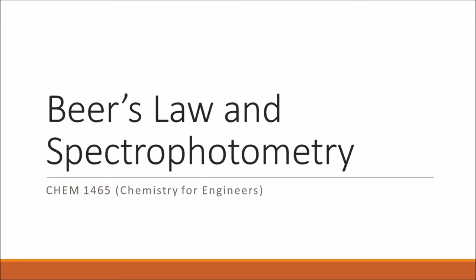Hi, today we're going to be talking about the Beer's Law and Spectrophotometry experiment for CHEM 1465. This experiment exposes you to things such as absorbance, spectrophotometry, and the equation M1V1 equals M2V2.